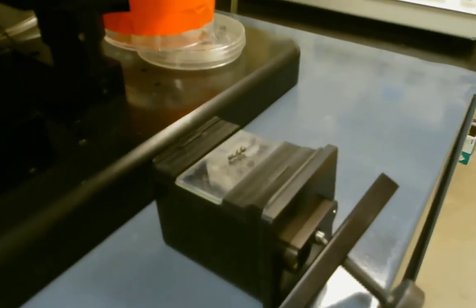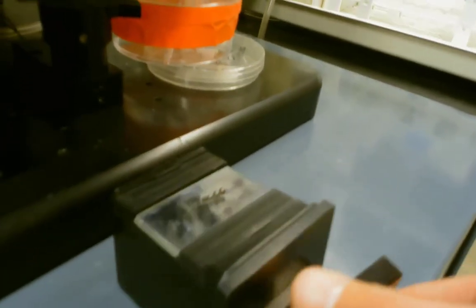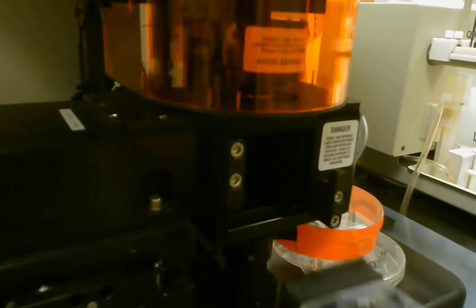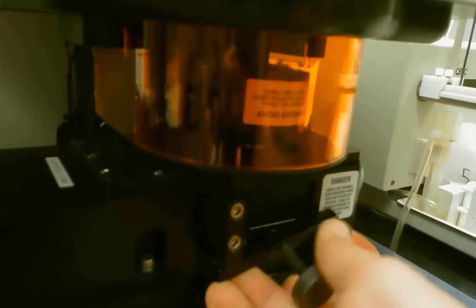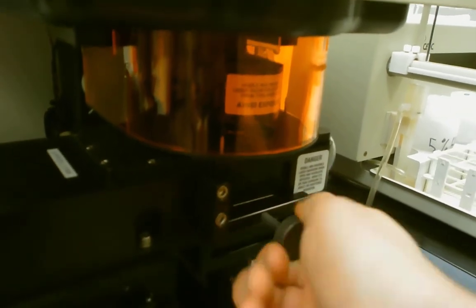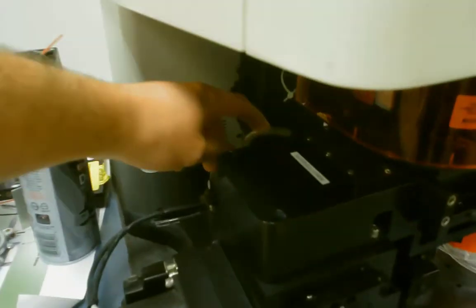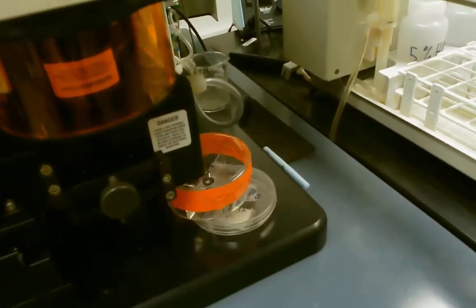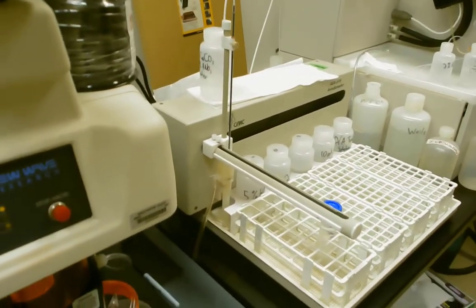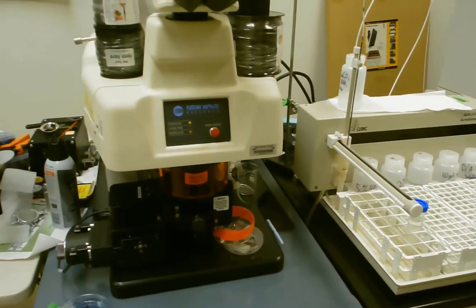So here's the sample holder that we're going to look at, and it simply inserts into the cell here and then clamps down to form a tight fit. The laser then will ablate the sample. Helium enters the cell in the back, exits out the side, and then is carried over into the argon plasma. So that's our introduction option for solid samples.